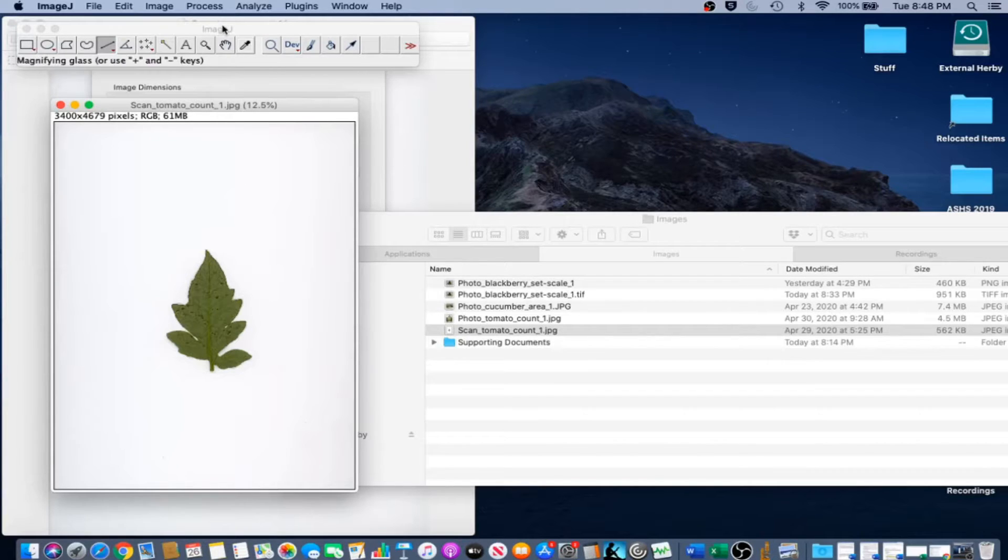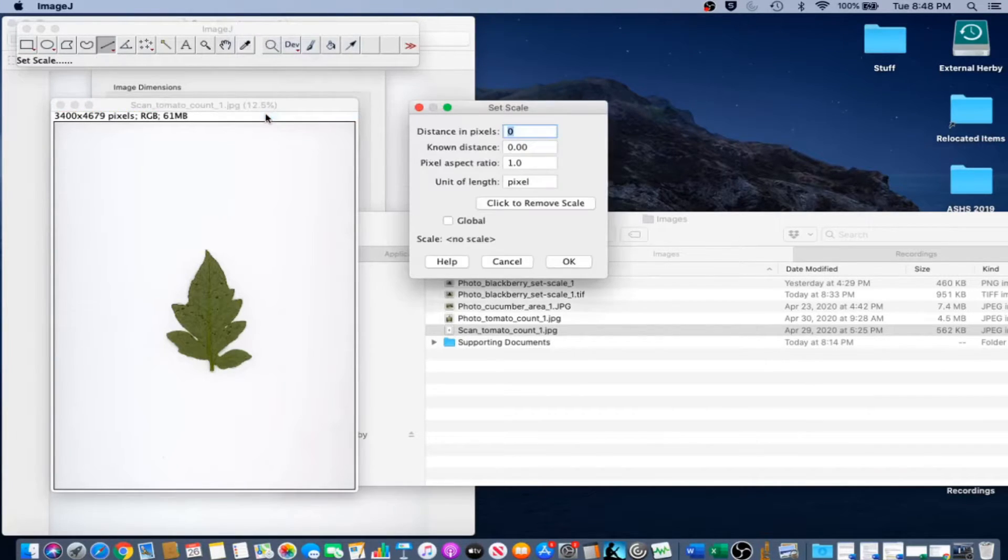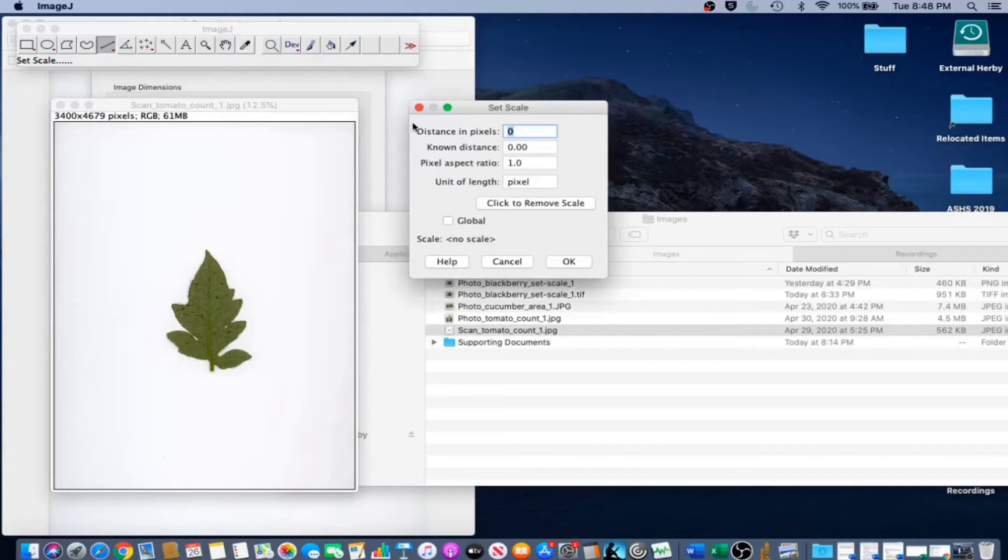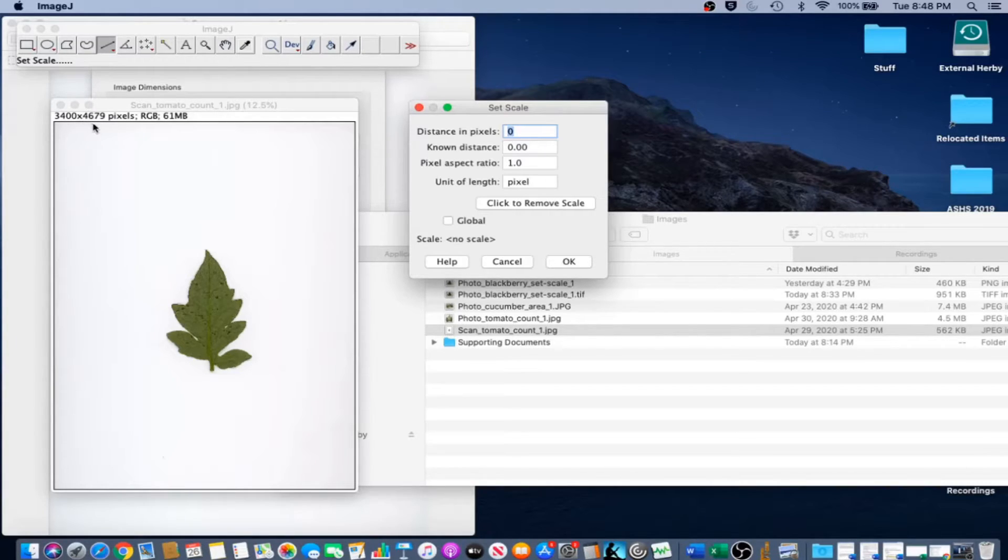Next, we're going to go to Analyze Set Scale. Notice that the pixel dimensions for the image are listed in the upper left corner of the image in ImageJ.